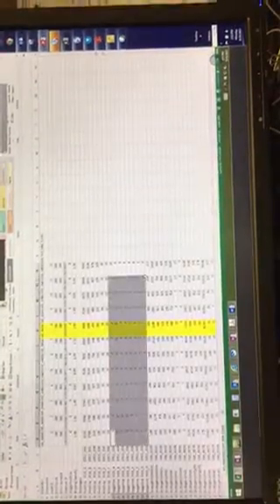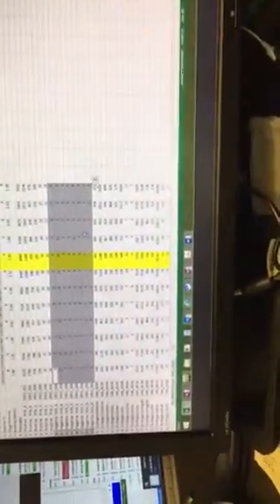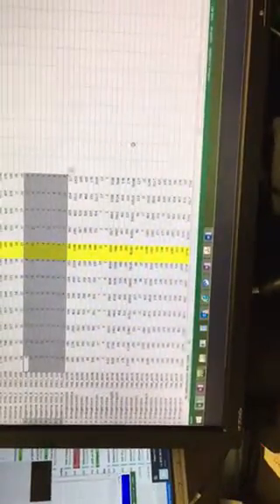But honestly, eyeballing this data, and I see a lot of data sets, this looks nice and robust. The endogenous counts look quite good here. A couple things I want to point out. The background, first of all, is nice and low here. The highest background count is 24, which is very nice. This is what we want to see as far as background.